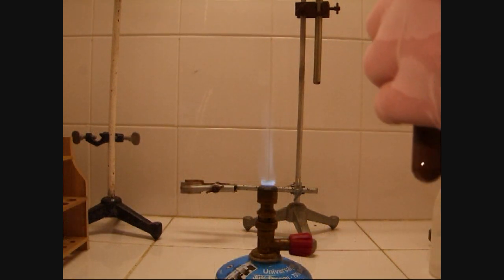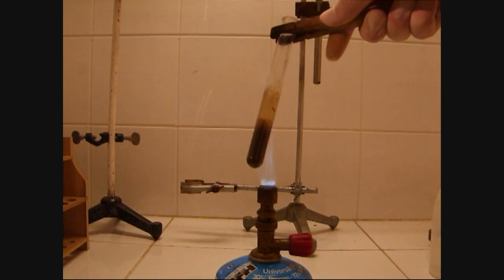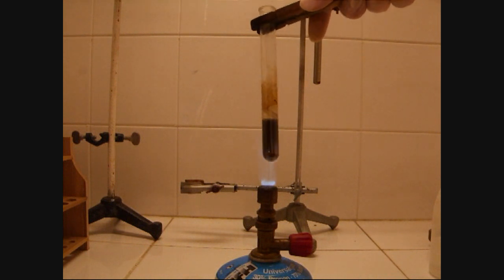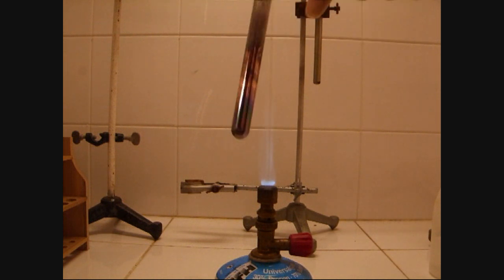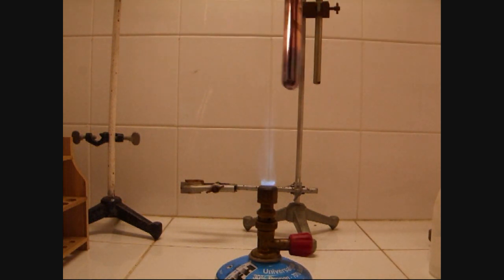Now to reduce the copper ions directly on the glass, the test tube is heated with a flame. The heat supports the reaction and slowly a clear copper mirror settles down on the glass.